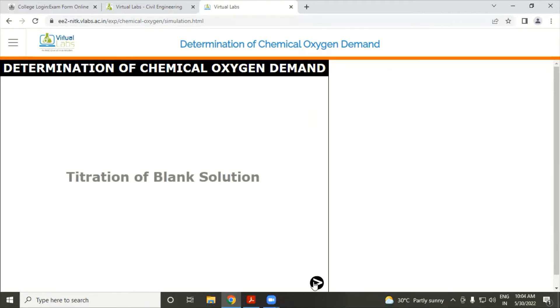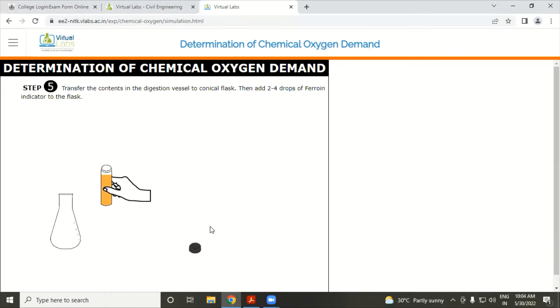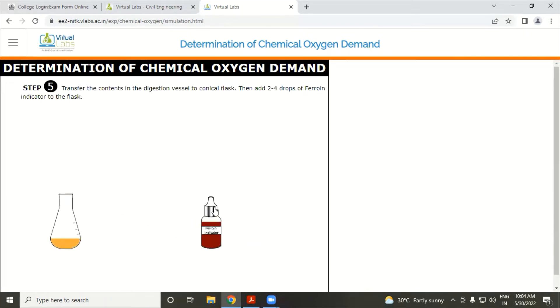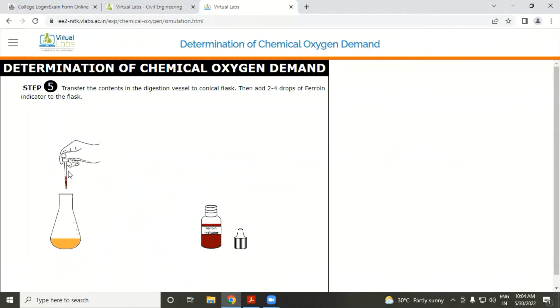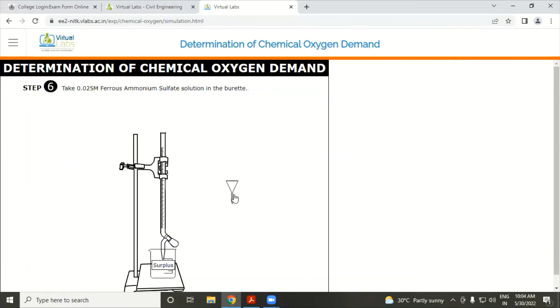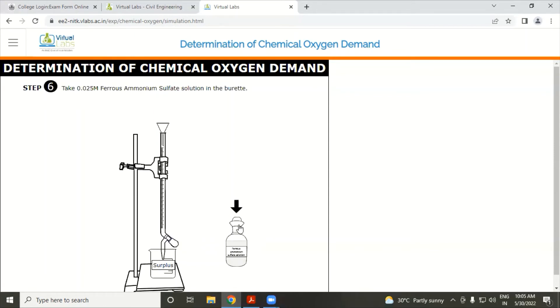The next part is the titration of the blank solution. Take the solution and add 2 drops of ferroin indicator. Take ferrous ammonium sulfate at normality 0.025 in the burette.